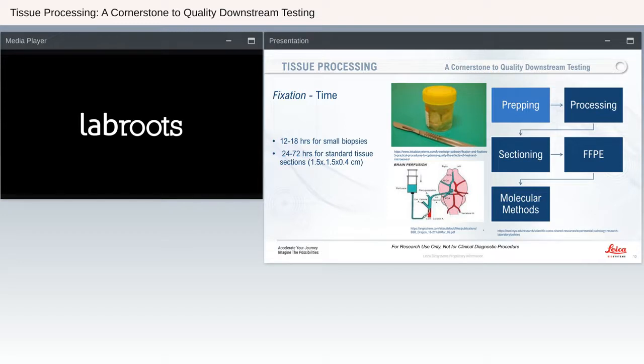So after you've prepped your specimen, whether it's bisecting the kidney or even piercing the serosa of some organs, such as kidney, uteri, maybe even liver, even those organs that maybe have a pseudo-serosa, such as prostate, we definitely want to make some type of incision so the fixative can get access if it's a whole organ.